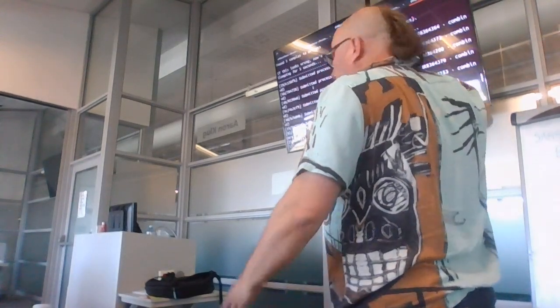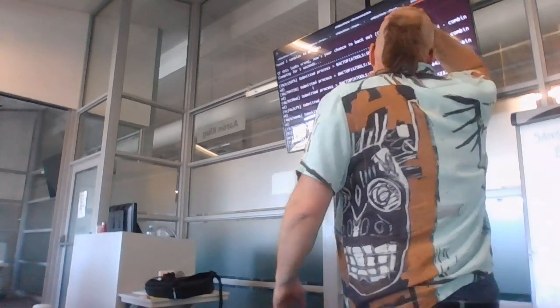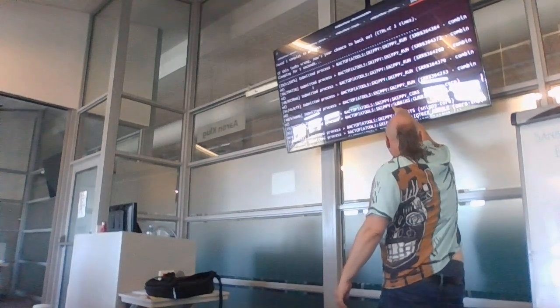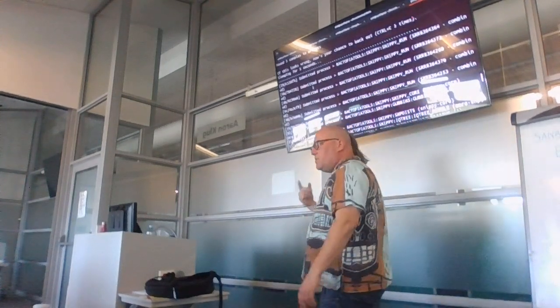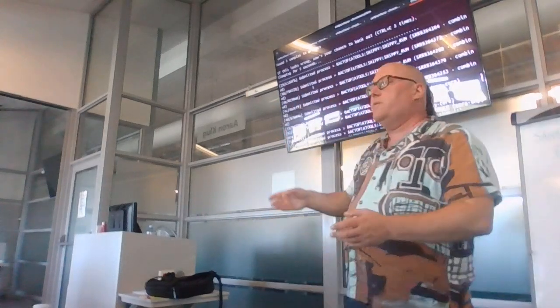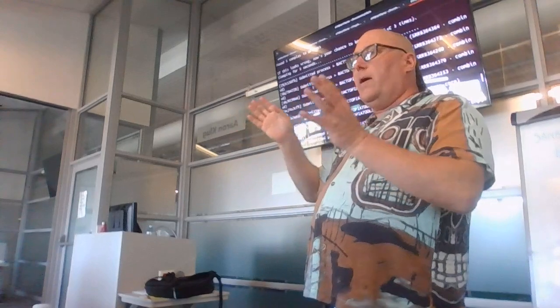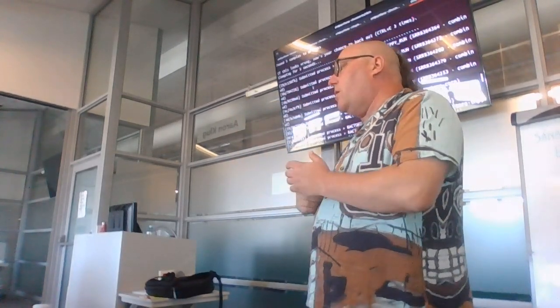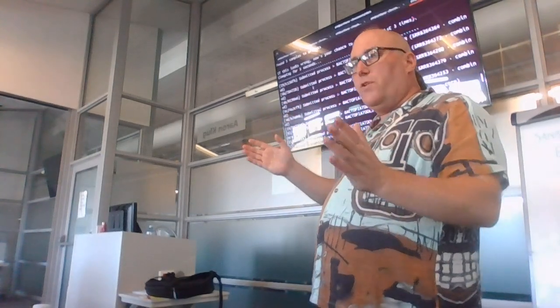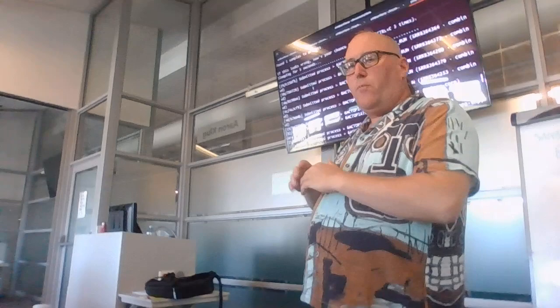In other words, it ran Snippy inside Bactopia. But then it ran Snippy core. Okay, if you read the Snippy website, you'll find out that what Snippy core is doing is that it reads the outputs of individual Snippy runs and it finds the core SNPs. Okay, so what the core SNPs are is SNPs which are present in all of the samples.